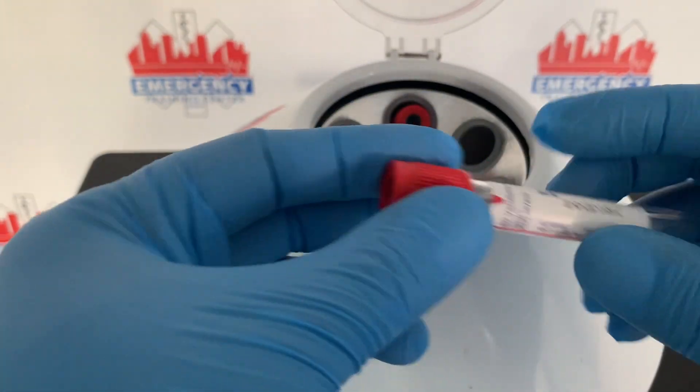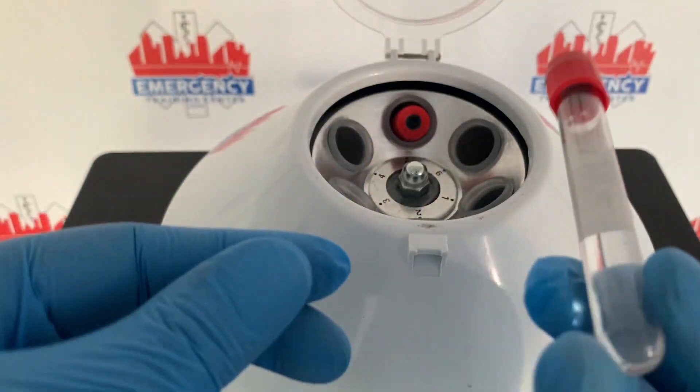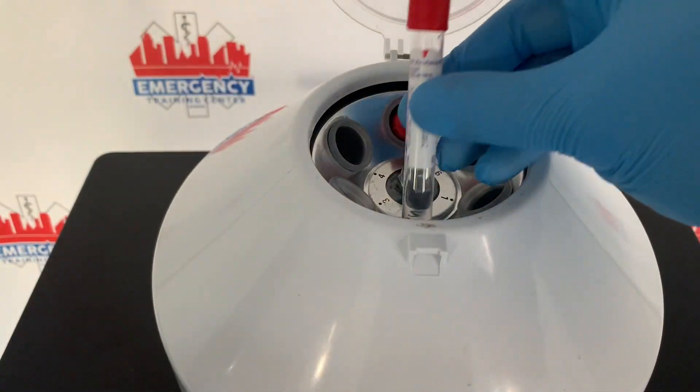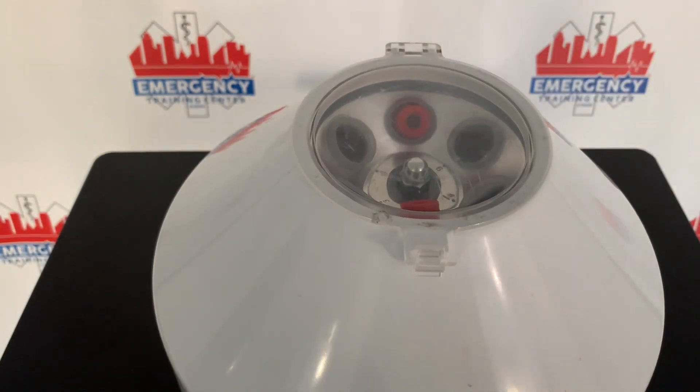You want to go ahead and place water inside the empty tube, as you can see here, and then place it in the machine. This should balance things out. Now the machine is balanced.